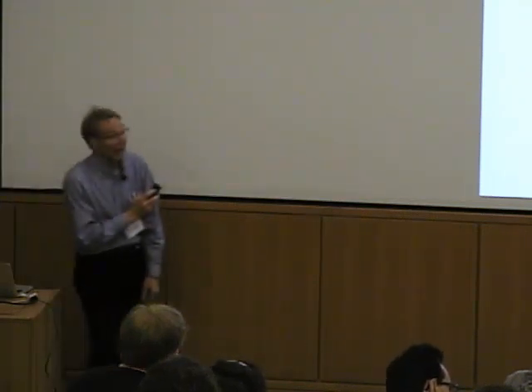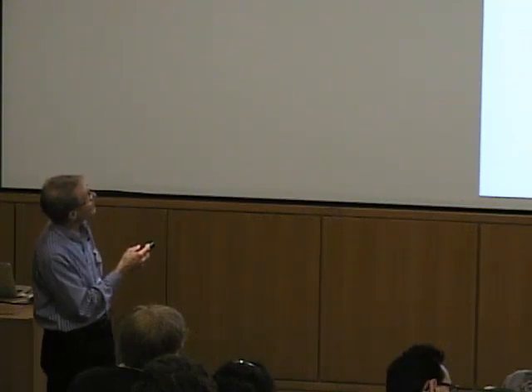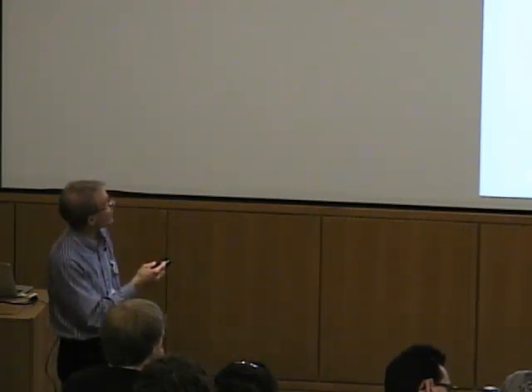Okay? And here's a series of buffers. Here's the data that we find in TEPA and DTPA. The stability constant, notice these are log betas. We don't really care what the stoichiometry is. We have a large excess of the buffer, but we find beta values, stability constants that are fairly similar, and enthalpies that end up being fairly similar in many cases.